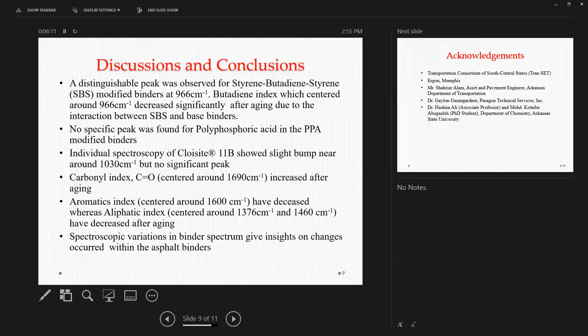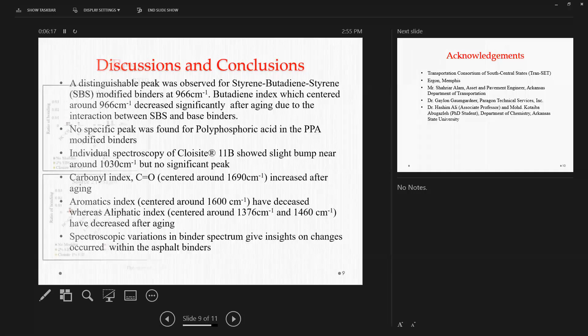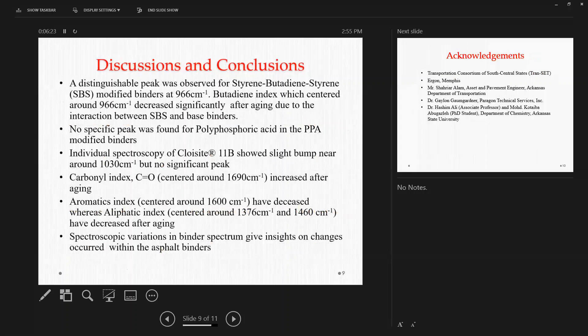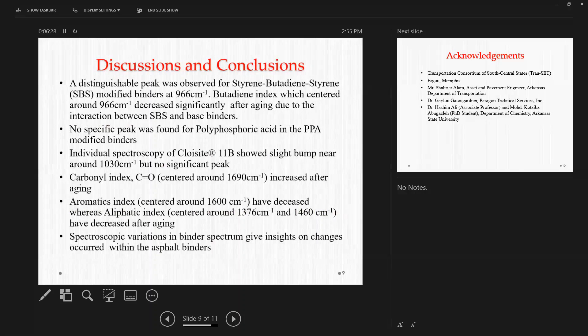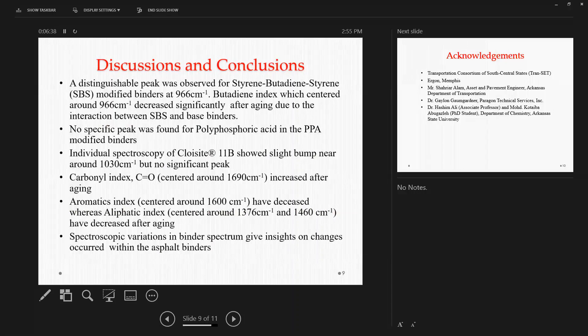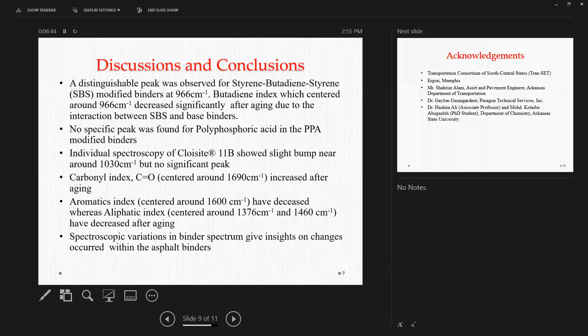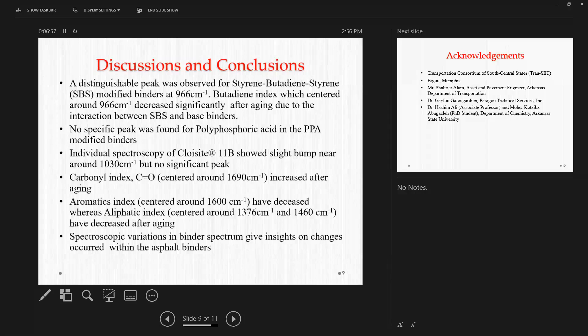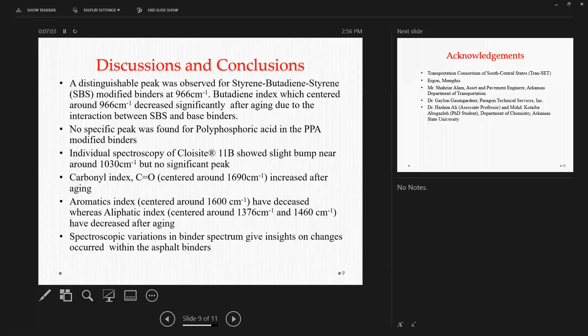Then we can observe the carbonyl index, which usually centered around 1690 wavelength. This specific parameter is very significant because as we know, when asphalt is exposed to aging, it gets oxidized. So the more aging an asphalt sample faces, the more of its carbon gets oxidized. So this parameter here can be related to the aging extent of the specific sample binder. So with the FTIR analysis, we can trace the extent of carbonyl index, which is the extent of aging on asphalt binders, which we can see increased eventually with aging, especially after long-term aging.